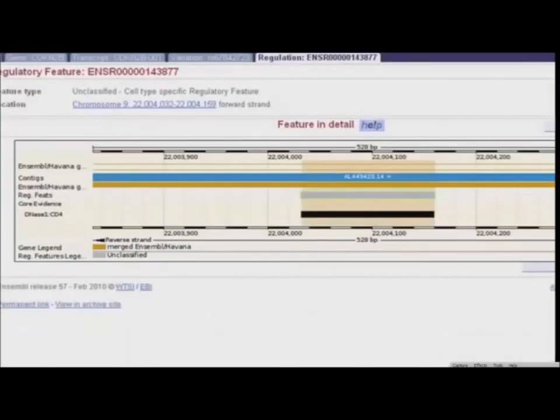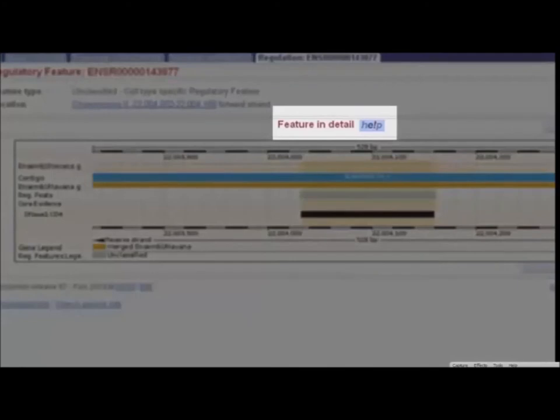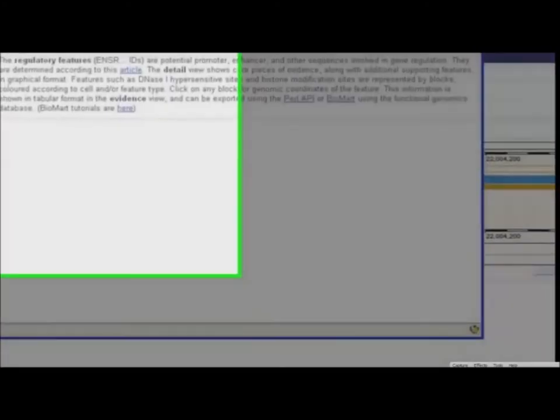Help is available for most Ensembl pages. Click on Help for more information about these features. In the Help window, we find a link to the documentation. There are also links to Frequently Asked Questions, the video tutorials, and the glossary. Either watch more videos or go ahead and start exploring on your own.